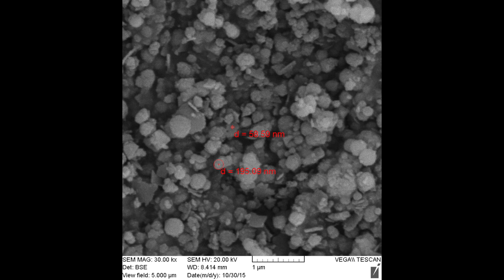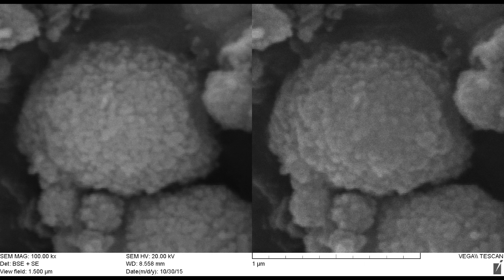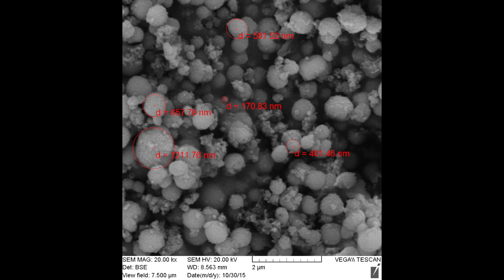I got a chance to look at them under the scanning electron microscope and you can see that some of them really are tiny at 50 or 60 nanometers. Most of them are a little bit bigger than that but they're still quite small averaging at about 150 to 400 nanometers.